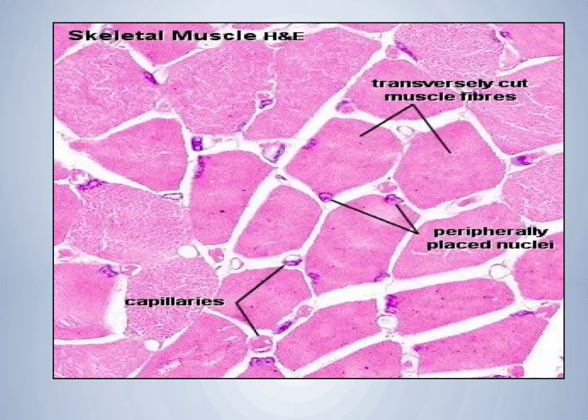In this picture we also have a transverse section in the skeletal muscle fibers, the same previous questions, and these are the nuclei peripherally located. But here we have additional information, which is the presence of these single cell layered blood vessels, which are minute capillaries present in the endomysium because they are surrounding the individual muscle fibers.